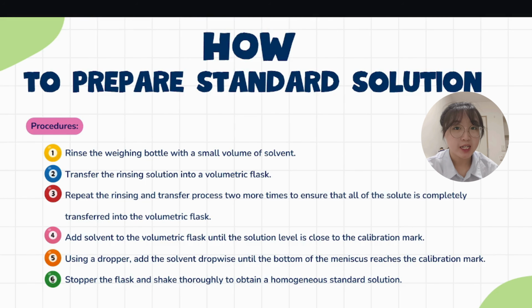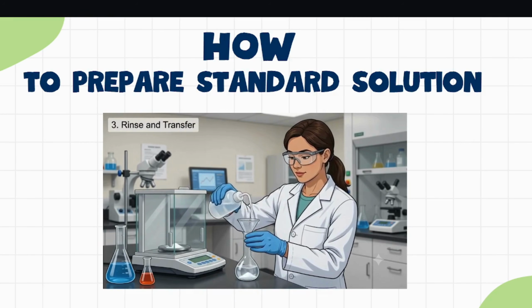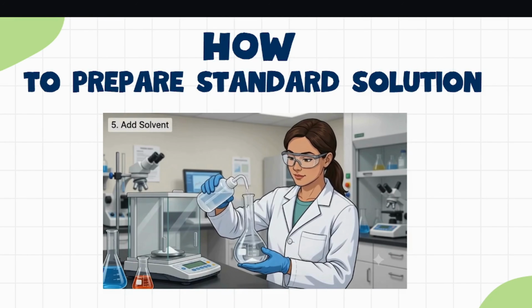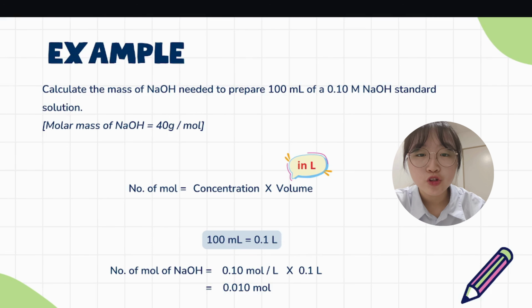So our next question is how to prepare a standard solution. For the detailed steps, I think you can refer to the slide, but actually I have generated a quick visual summary for you to look at the whole process. So now let us put this into practice with an example.